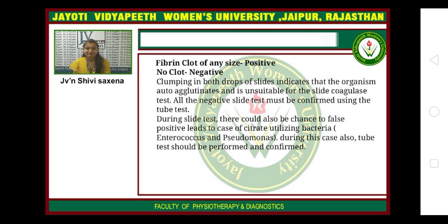During the slide test, there could also be a chance of false positives in the case of citrate-utilizing bacteria, Enterococcus and Pseudomonas. In this case also, the tube test should be performed to confirm.